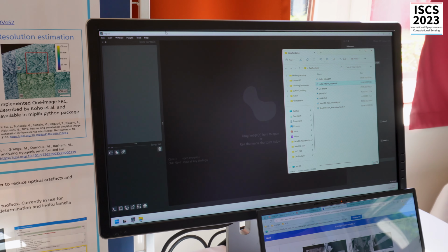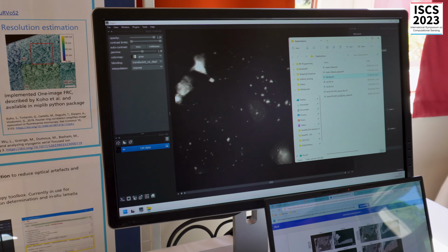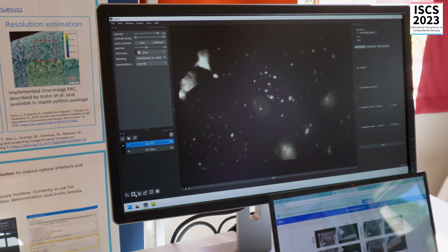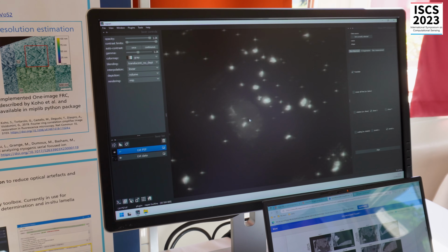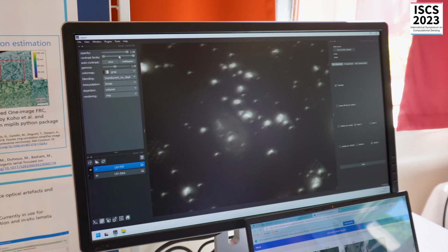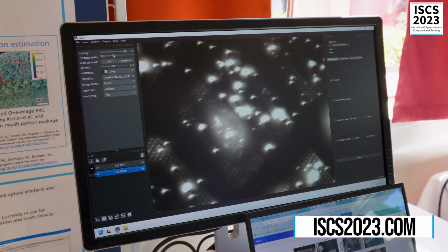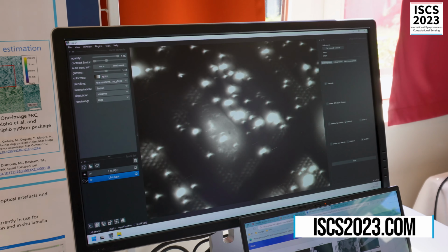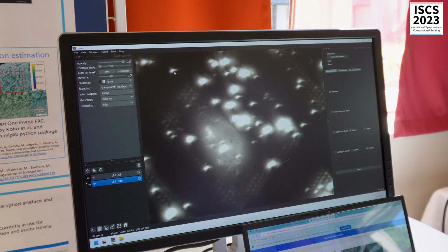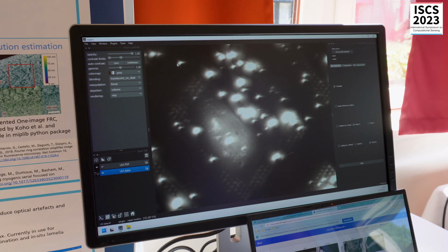These are both napari plugins, which is there. That's the data. It's a PSF. If you just look at the data there, it's 3D data of HeLa cells on a SEM grid that has been cryo-frozen. Just ignore that. Yeah, so that's a cell and those are beads. The beads are supposed to look like tiny spots, and they don't look like tiny spots because they're blurred by the PSF.